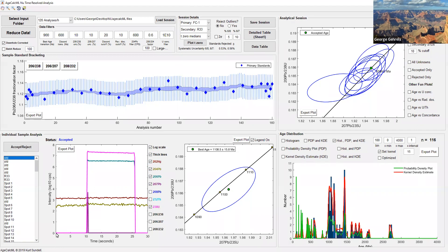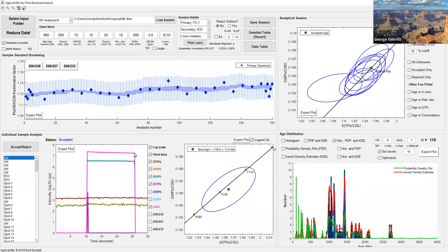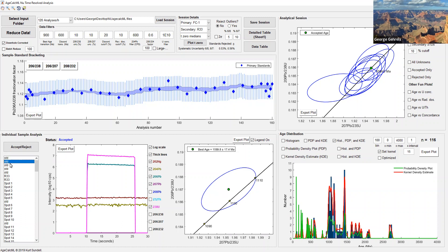We start here at time zero. We count for about 10 seconds with the laser off, and this is what we call backgrounds, the ion intensities coming into the collectors when there's no laser firing, no sample being ablated. We fire the laser right here, and you can see rapid, almost instantaneous increase of the uranium and lead signals. We fire the laser continuously, this is seven hertz per second repetition rate, for about 15 seconds. We turn off the laser and you see this rapid washout down back to background values. We let it wash out for a few seconds and then start the next analysis.